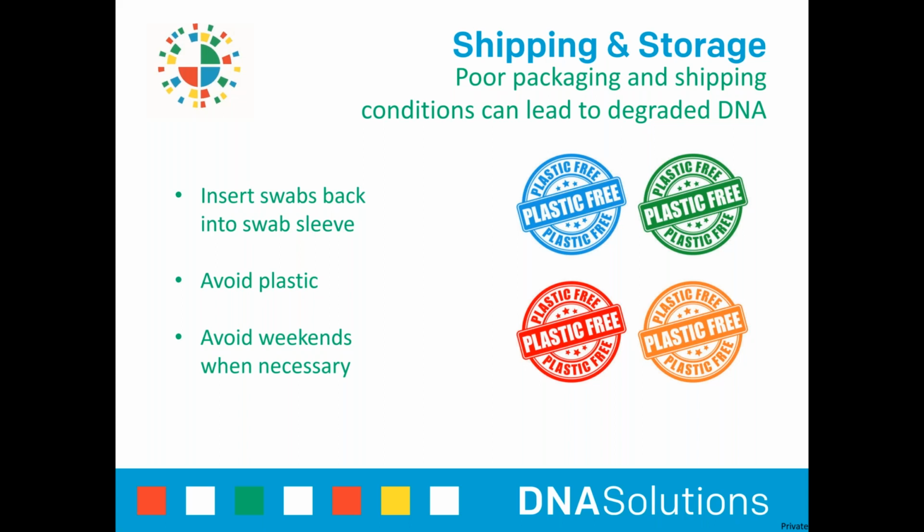If possible, avoid shipping samples over the weekend, as this can help prevent samples from degrading. This is especially important for non-standard samples such as urine, whole blood, tissue, and bones, as you certainly do not want those types of samples to sit over the weekend in a warm warehouse. If a sample is being stored cold in the freezer, then be sure to ship it in a cooler on dry ice. No sample should sit in a FedEx drop box over the weekend. You can always take your samples into a FedEx location if needed.